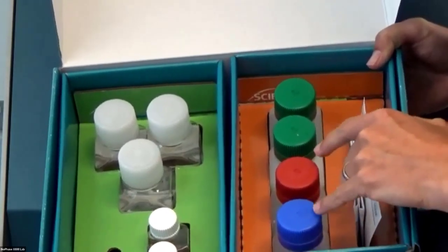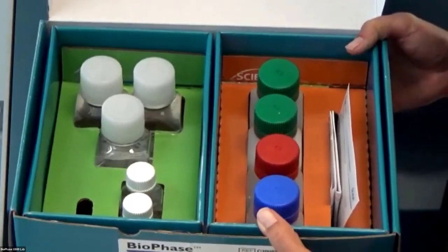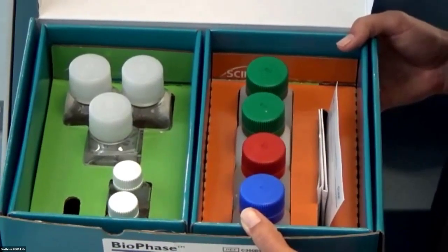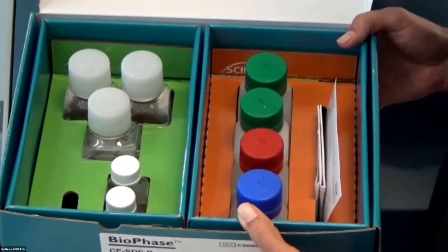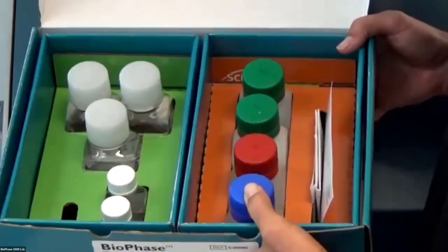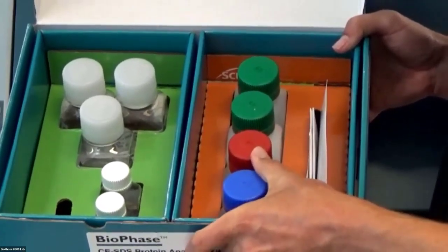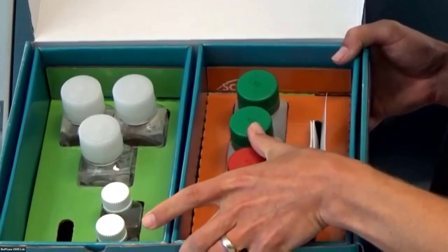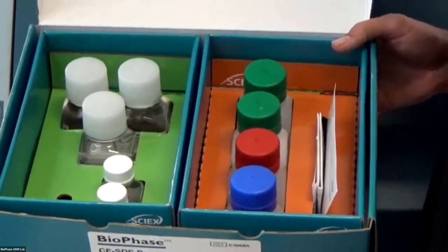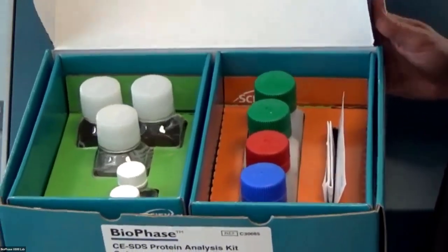Now, as I mentioned at the beginning, all these caps have different colors. This is going to correspond to our reagent file in the BioPhase 8800 software. So when we're loading our reagents into our reagent plate, they're going to be color-coded. Where we load our basic wash is going to be color-coded blue. Where we load our acid wash is going to be color-coded red. Where we load our gel buffer is going to be color-coded green. Very nice concept that I enjoyed seeing and have thoroughly enjoyed using when I've been playing around with this piece of equipment.